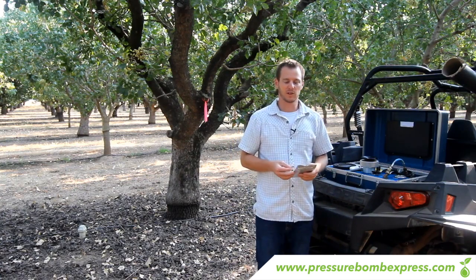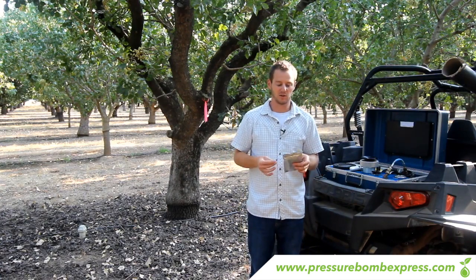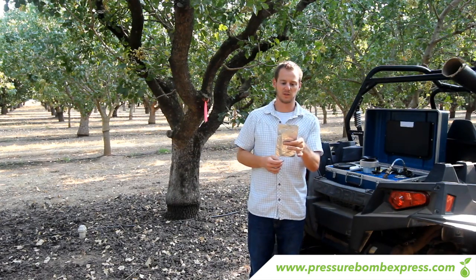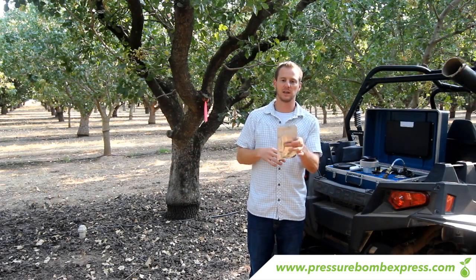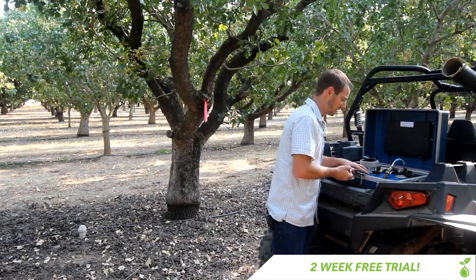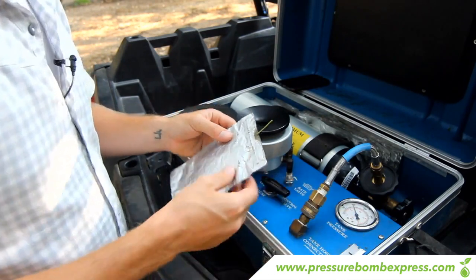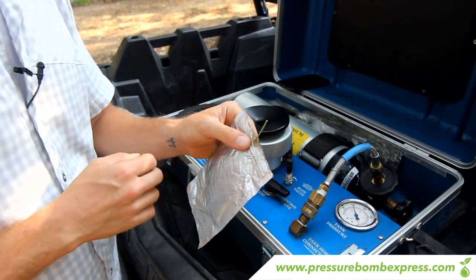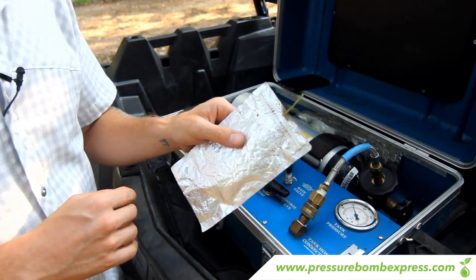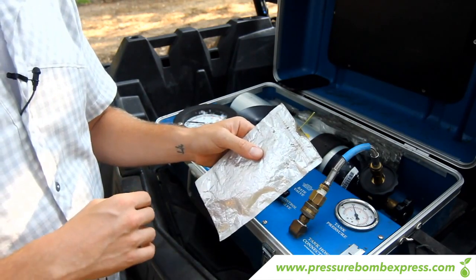At this point we're going to start pressure bombing the pistachio leaf. Pistachios are the trickiest leaf to pressure bomb — the main thing is we need to first make sure we get enough stem to get it into the pressure bomb unit. I'm going to take my razor blade, set the stem on a flat surface, make a clean cut, which makes it a lot easier to see when the water comes out. The pistachio is probably the trickiest tree to pressure bomb because you also have to take into account the phloem on this tree.